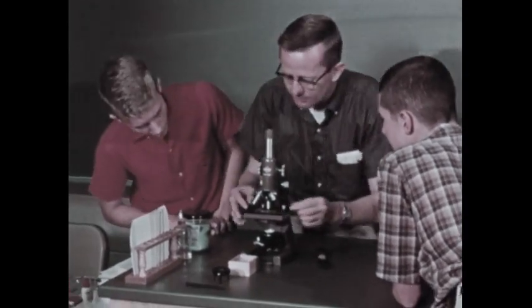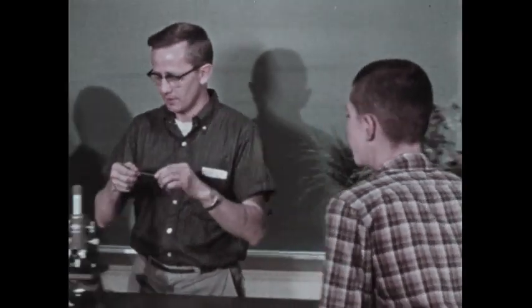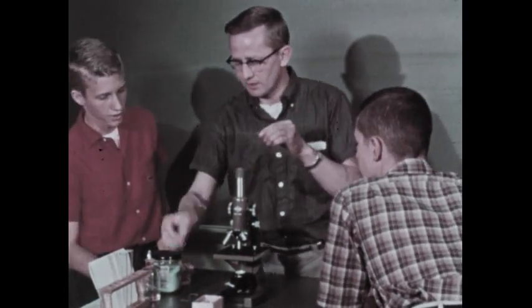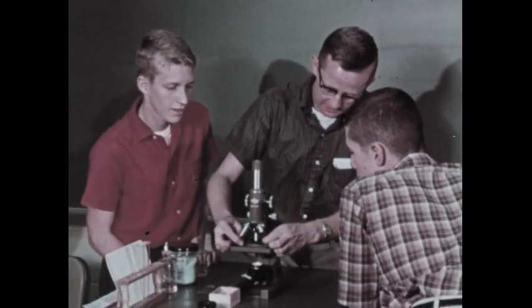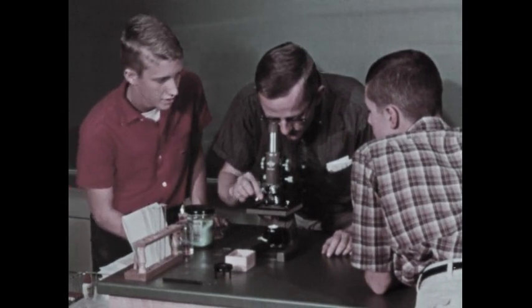Setting the microscope for low magnification, we see that humus is made up of bits of decayed plant and animal matter. This makes it organic. Now, preparing another slide of a sample of topsoil, adding some water, and using higher magnification, we can see bacteria, simple plants.